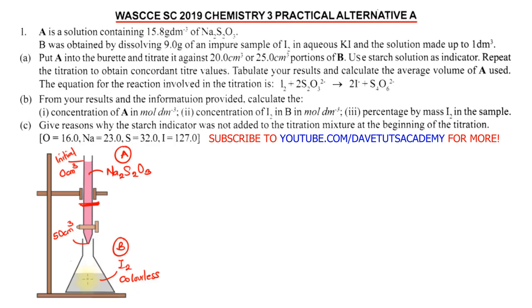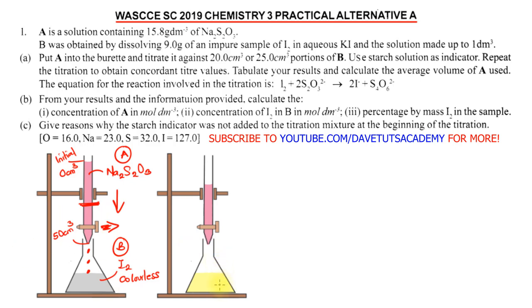The solution in the conical flask is colorless. We are not going to add the indicator at the beginning of the titration. As we release sodium thiosulfate into the iodine solution by opening the burette valve, droplets of sodium thiosulfate fall into the iodine solution. We need to note the color change — the first thing we will notice is that the solution turns yellow. When the solution turns yellow, this is not the completion of the titration; it is the indication that we can now add the starch solution.